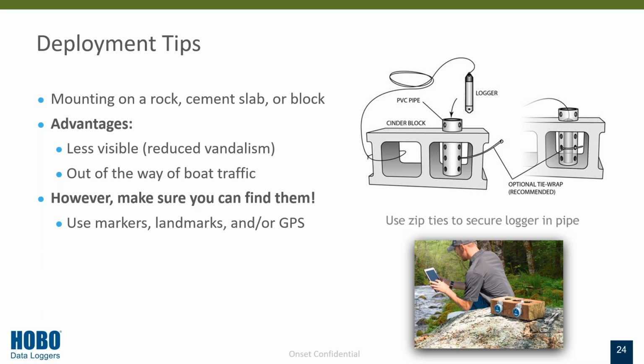Some other mounting options. Again, we always recommend that you put the logger inside of the housing unit. In addition to that, to make sure that it doesn't float away, you can get creative and really mount it to anything heavy. So think of your cinder block, a big rock, anything of that nature. Advantages to this, it's not visible to the public, so you don't have to worry about curious people wanting to take these away.